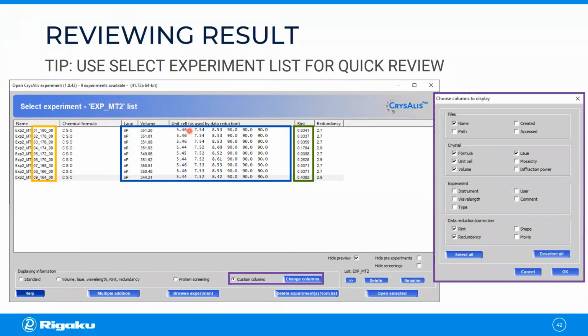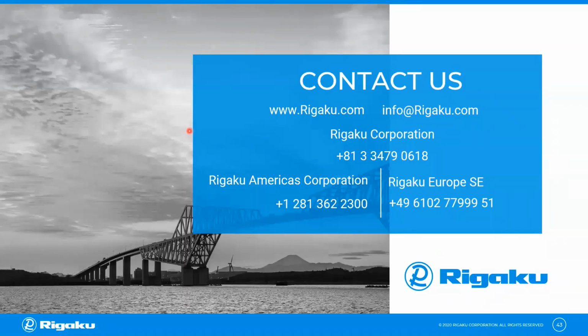And then that basically brings us to the end of my talk and presentation. I hope you have some questions that I can answer now.